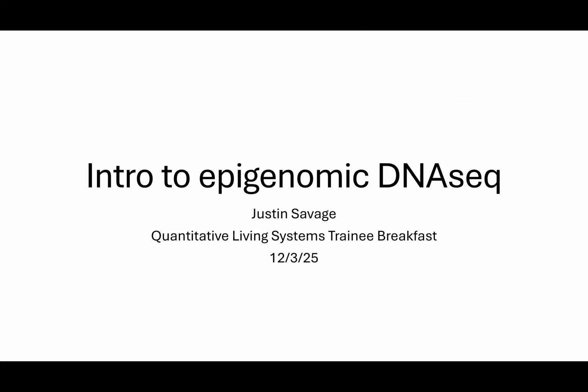So welcome all. Like last time, I'm Justin, a six-year grad student in Charles Ariglou's lab. We talked last time about some RNA-seq data analysis, and today we're talking about what I call epigenomic DNA-seq. I'll talk a bit about which particular techniques, because there are several techniques in epigenetics that are all similar, and then there are some that are quite distinct that I won't talk about today.